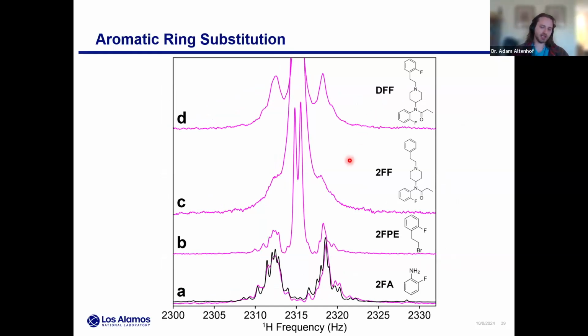Now, ultimately looking at the more lethal types of fentanyl, you could have the fluorine just at the aniline ring, this monofluorofentanyl. You could also have this difluorofentanyl, with a similar substitution here, but also at the phenethyl ring. In either case, I'm also looking at the starting reagent, this fluoroaniline or this fluorophenethyl. In these cases, because it's a conjugated ring, we're talking about a 3-bond coupling between hydrogen and fluorine. It's much smaller, just 10 hertz.